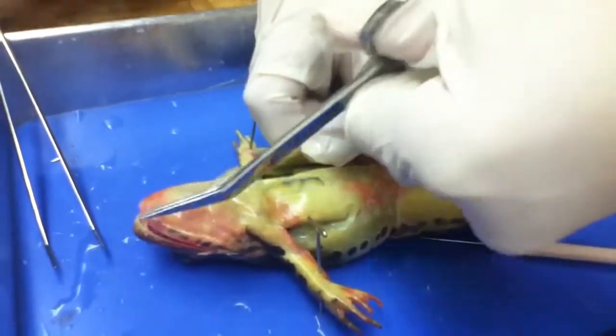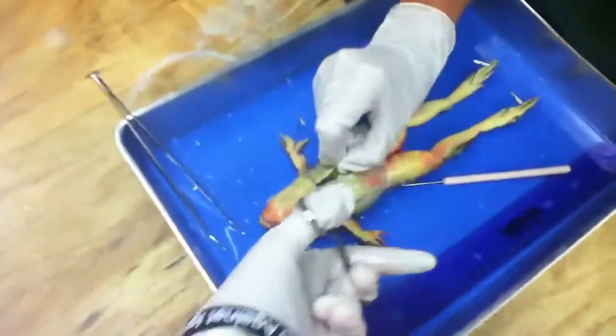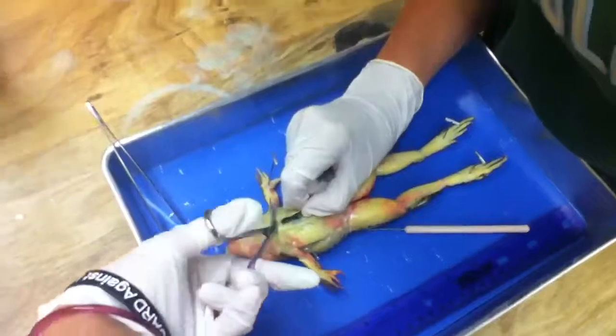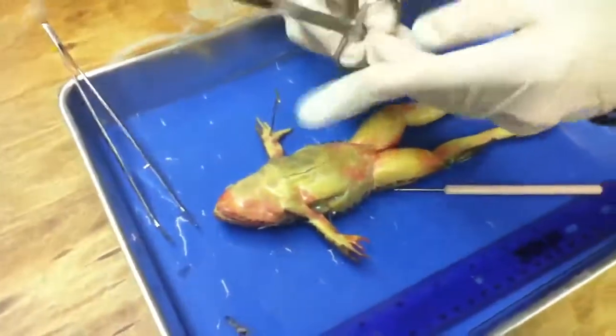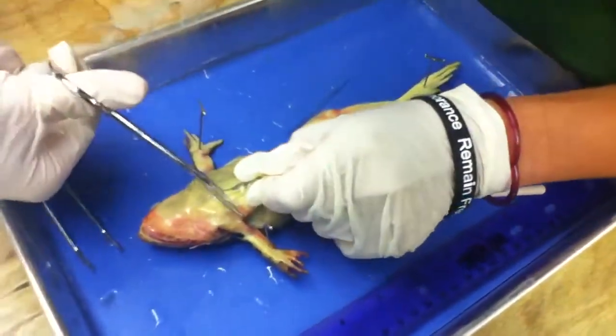Okay. Now you want to cut sideways on both sides. Cut this way, cut this way, cut this way. And then you should be able to peel him back. Pin him down. Not yet. Same thing. You open it up like the old cereal boxes, the individual cereal boxes where you open up and put the milk in it.